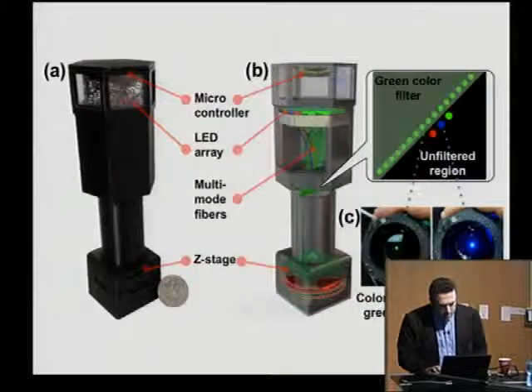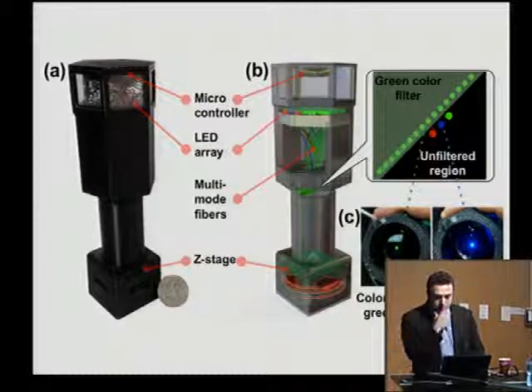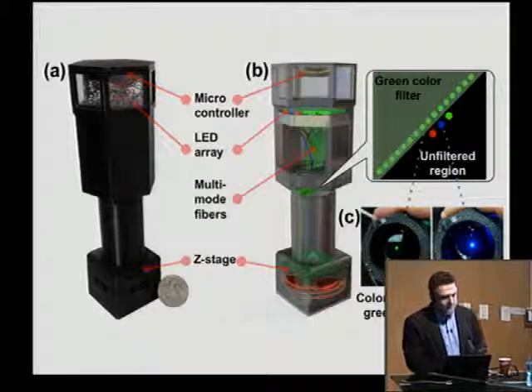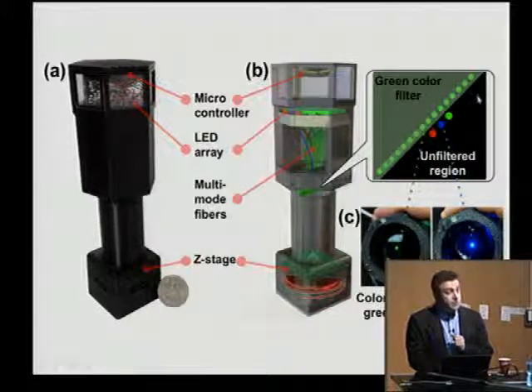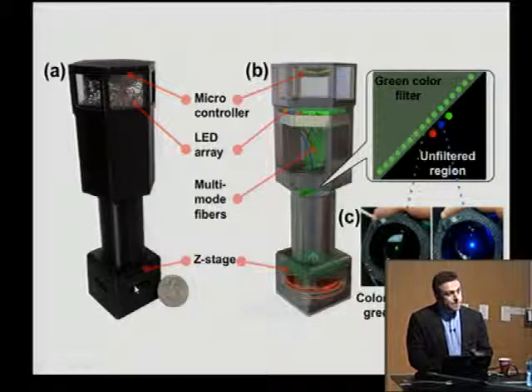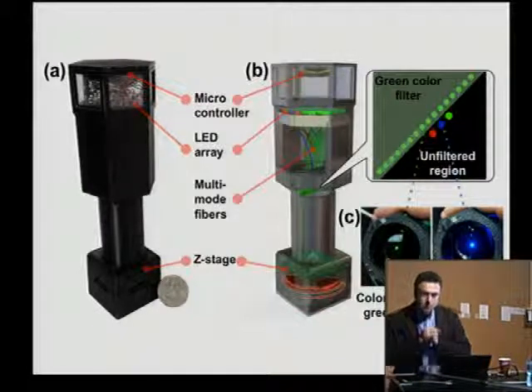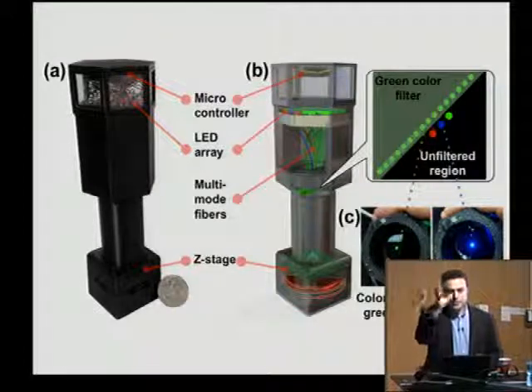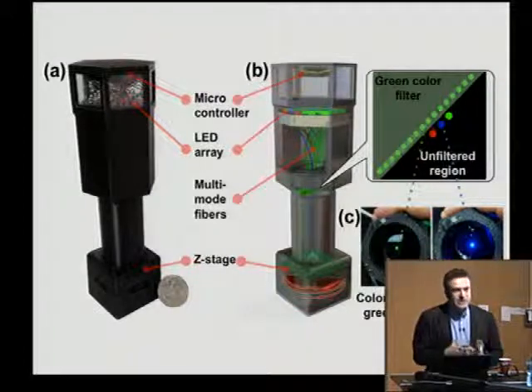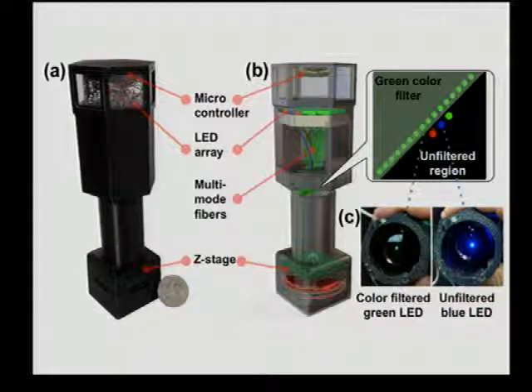In terms of a recent state-of-the-art field portable implementation, this is what you are looking at. It's essentially a pixel super resolution microscope that has some LEDs here. It has also some color so that we can do colorization digitally. One additional degree of freedom here that I haven't mentioned so far is modulation of the gap between the sample and sensor. That modulation, just like the super resolution aperture modulation, doesn't have to be repeatable. And we do not need to know that because we can actually do autofocusing to understand the delta Z.